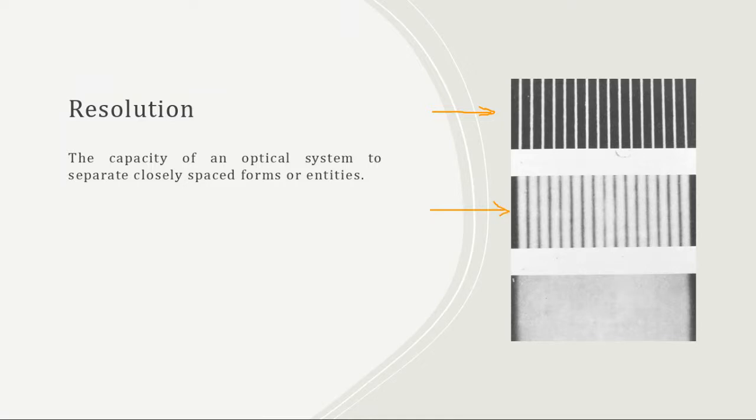You can't really tell if, you know, if I were to start measuring here to here, is it nice and crisp compared to here to here? And then of course the bottom image is completely just poor resolution. You could probably see some of these very faint foggy lines, but it's pretty much one big blur.